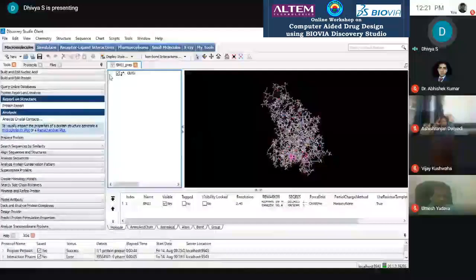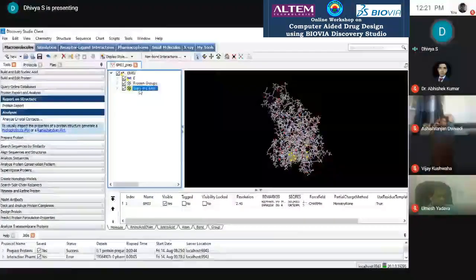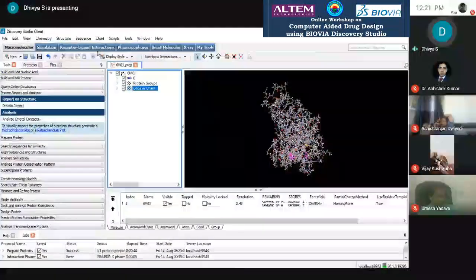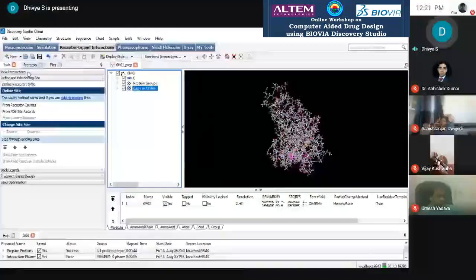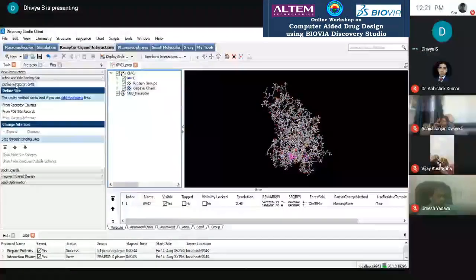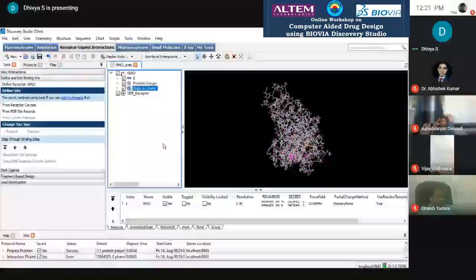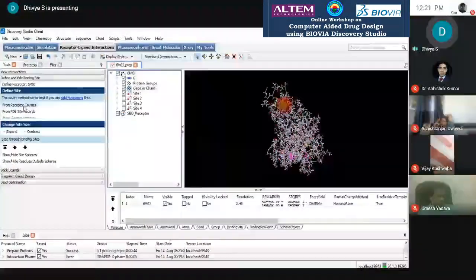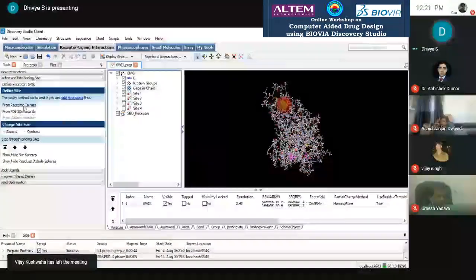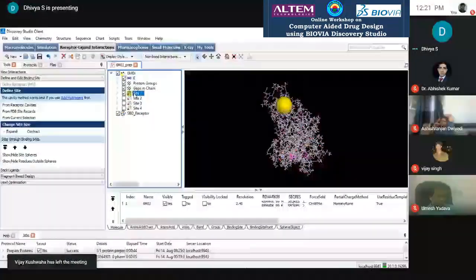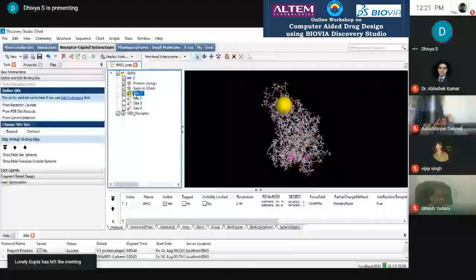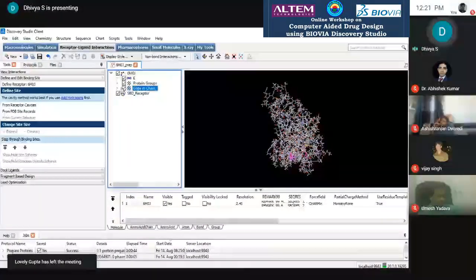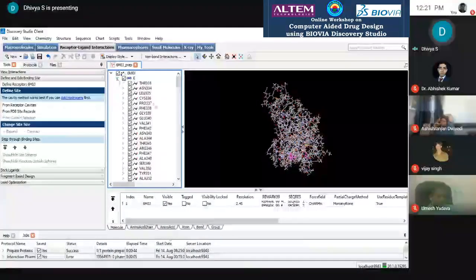The next step is to identify and define the binding site. If there are gaps in the chain, they will be highlighted in a different color. Go to Receptor-Ligand Interactions, then Define as Receptor. Once you define the receptor, you can run the binding site detection via the receptor cable. However, PDB site records are not present for this structure, so it will not show PDB site records.